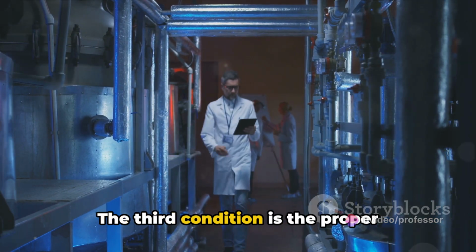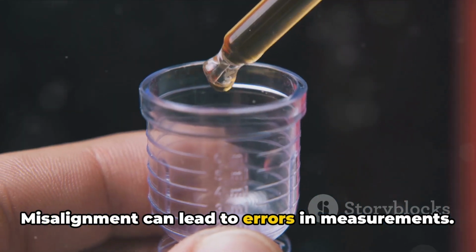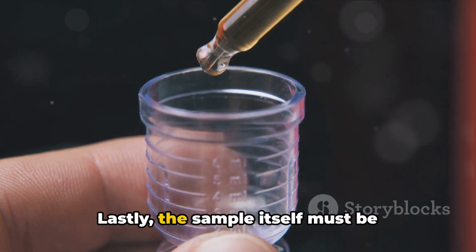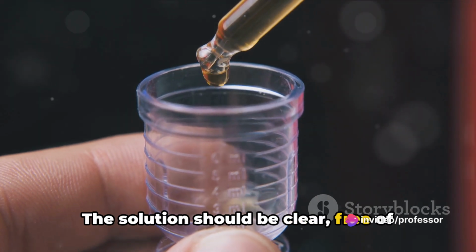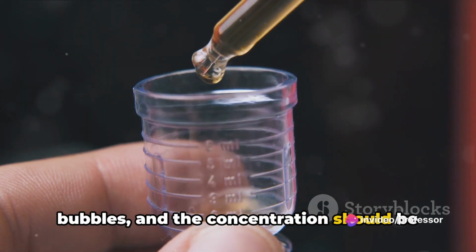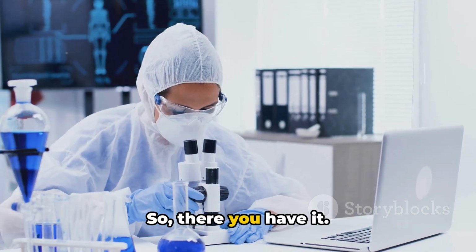The third condition is the proper alignment of the instrument. Misalignment can lead to errors in measurements. Lastly, the sample itself must be prepared optimally. The solution should be clear, free of bubbles, and the concentration should be appropriate to prevent saturation or too low absorbance.